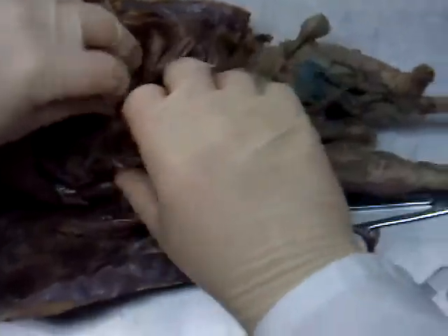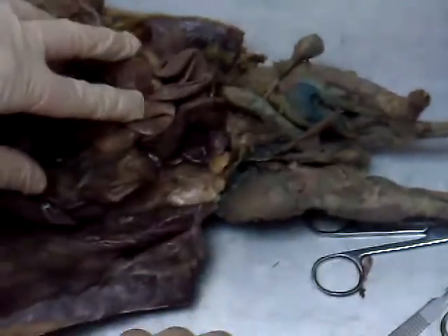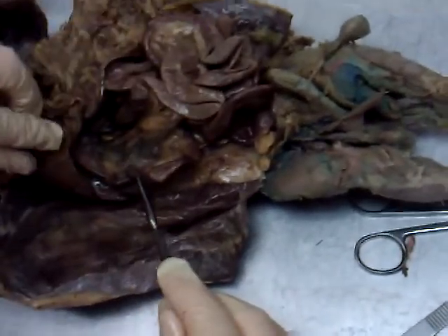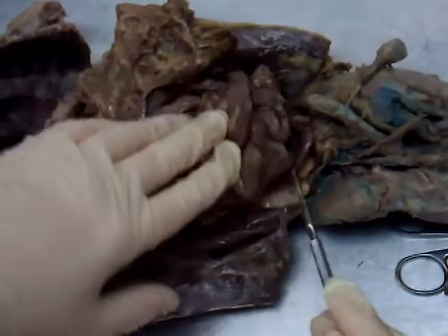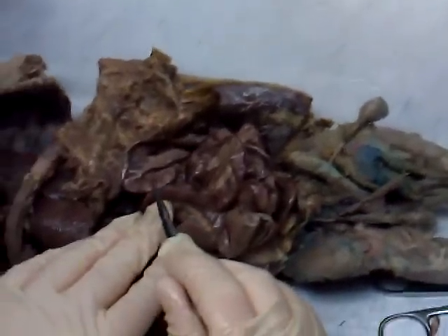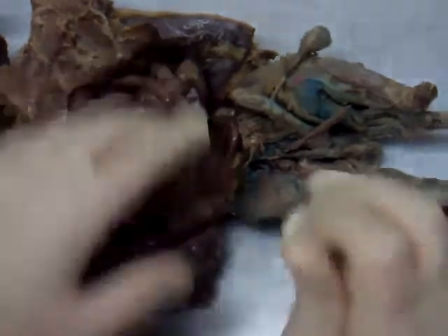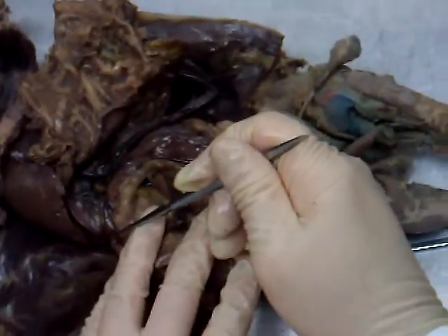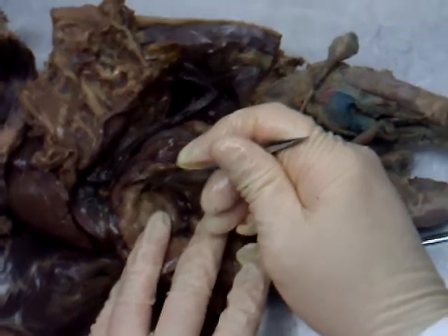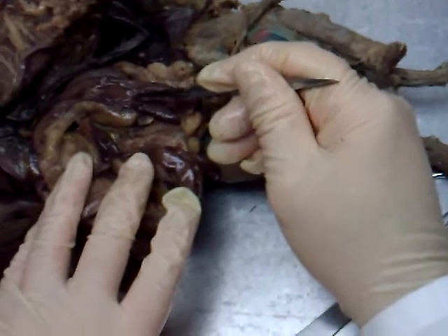Going down the right-hand side here is the duodenum. It will curve towards the center. The upper loops are jejunum; the lower loops are ileum. Flip everything over to this side now — here's the end of the ileum coming around here.